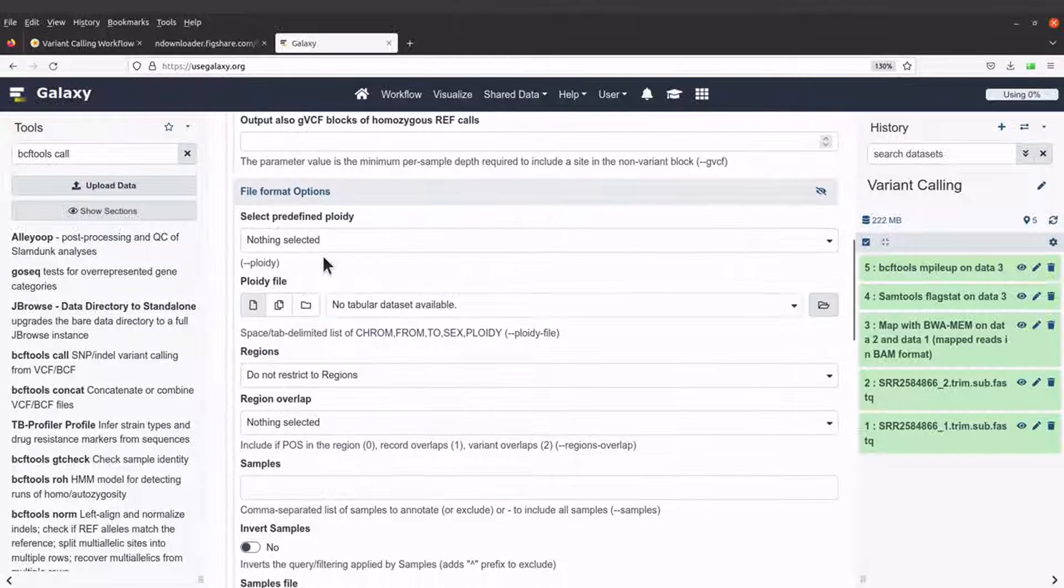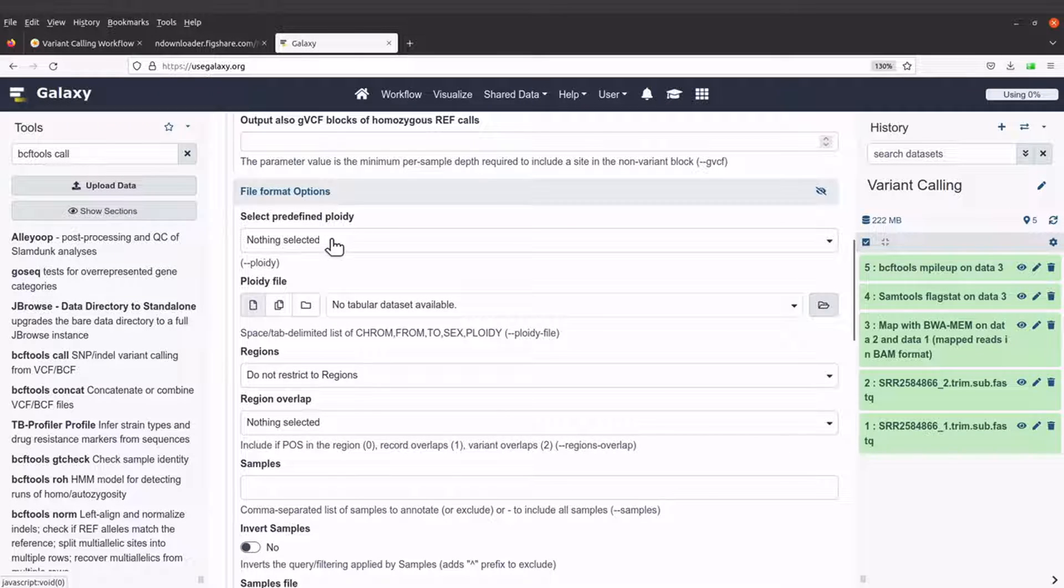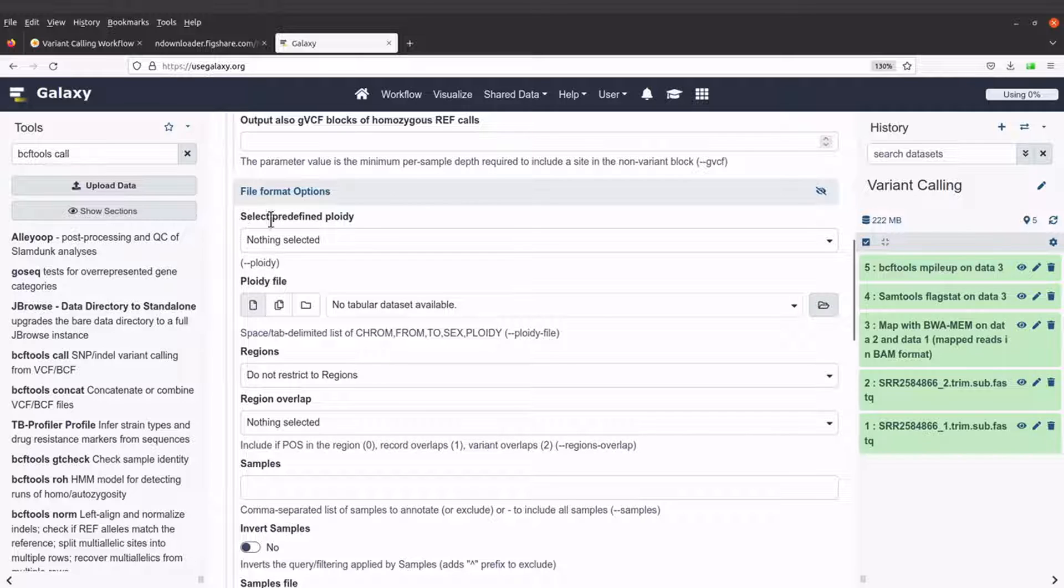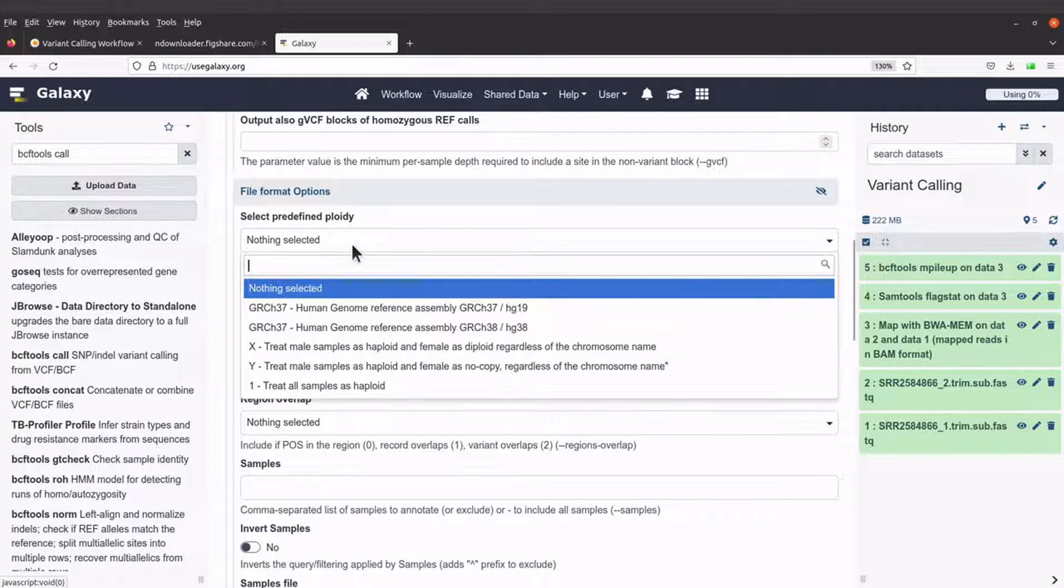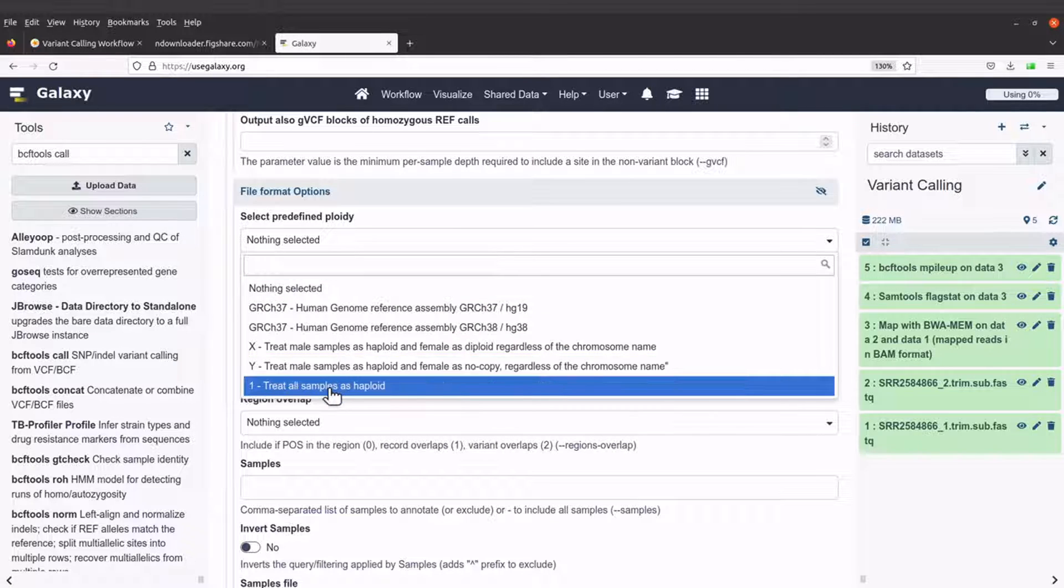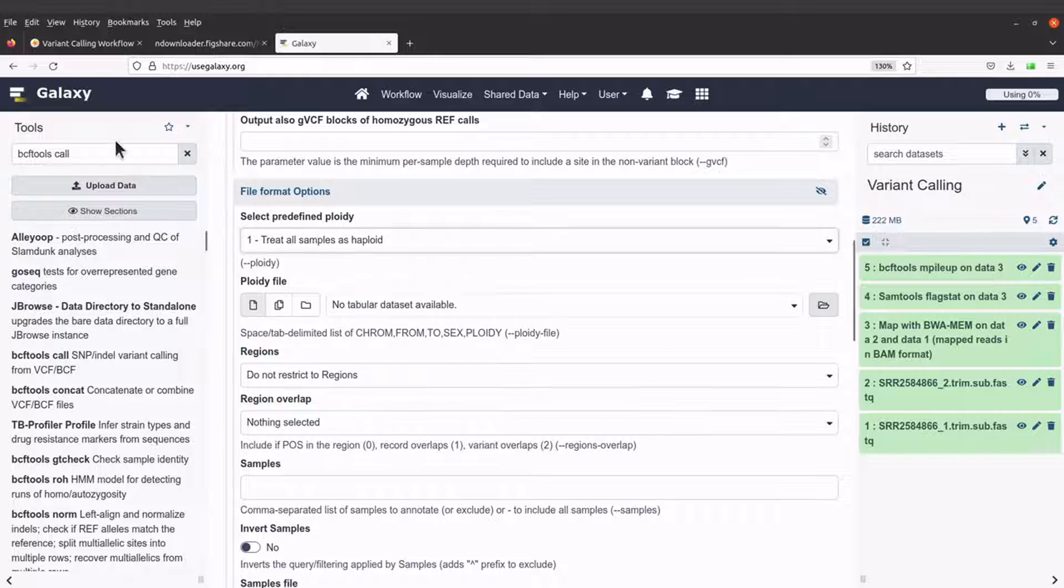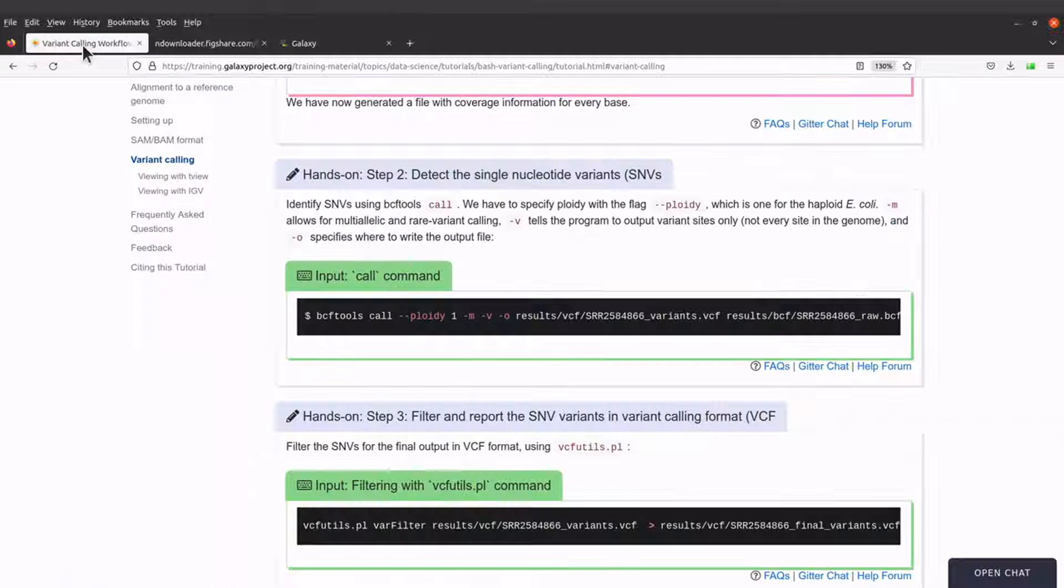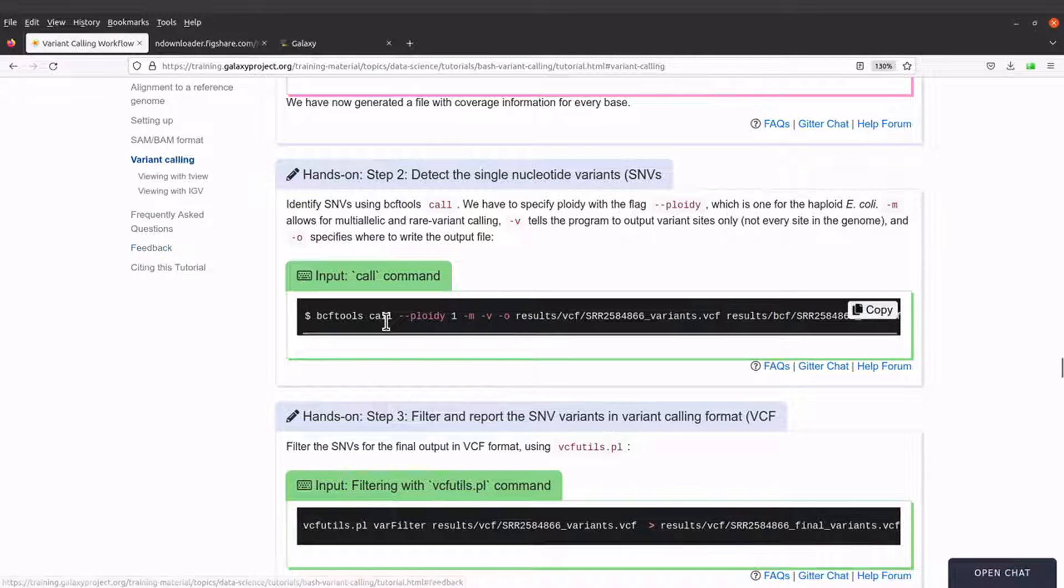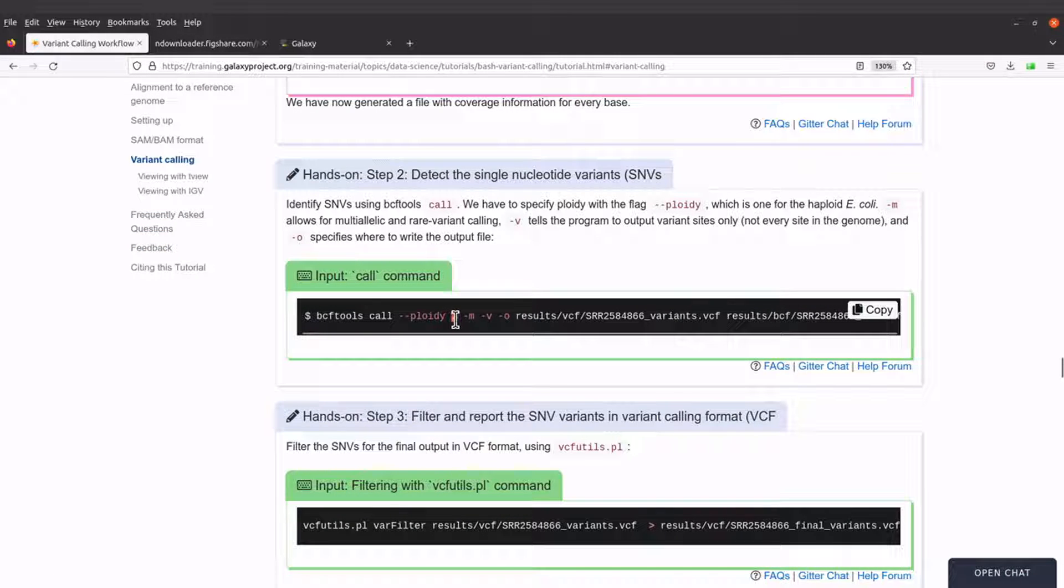Here we will select a ploidy of one. So when we come to select predefined ploidy, you use one. Because here it's specified as one.